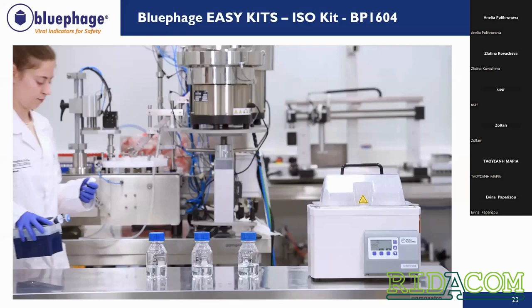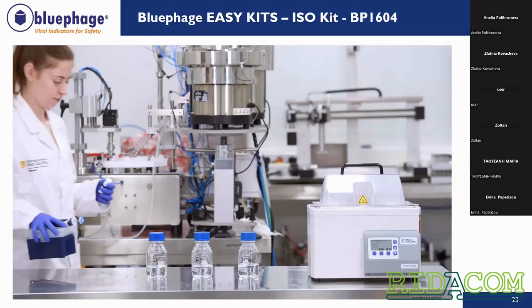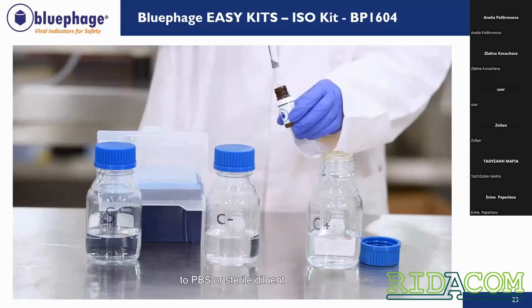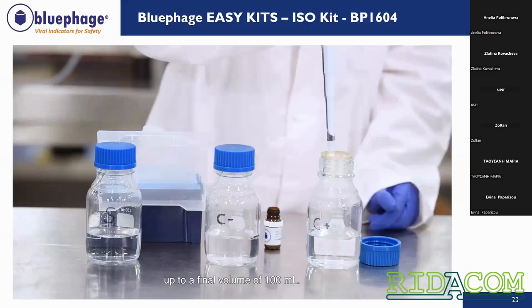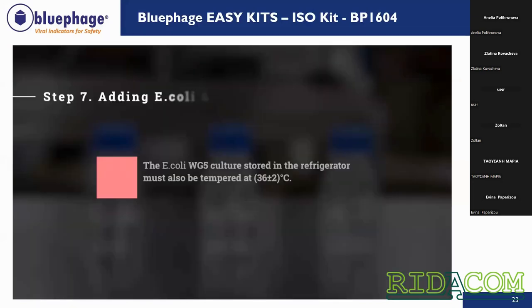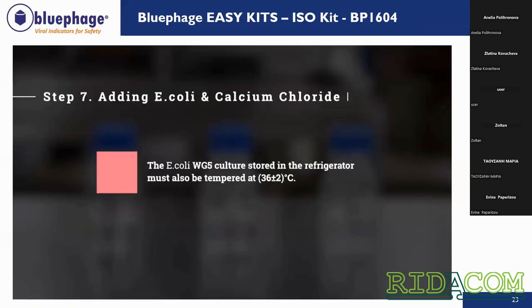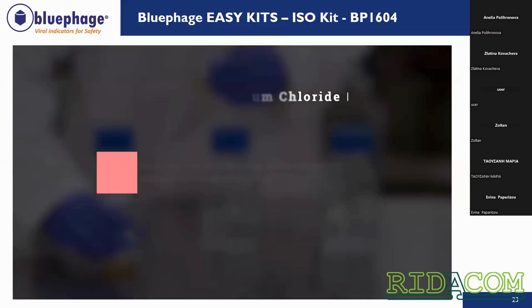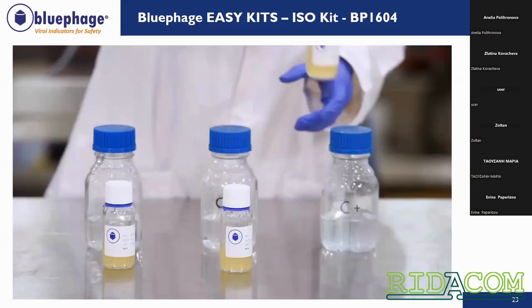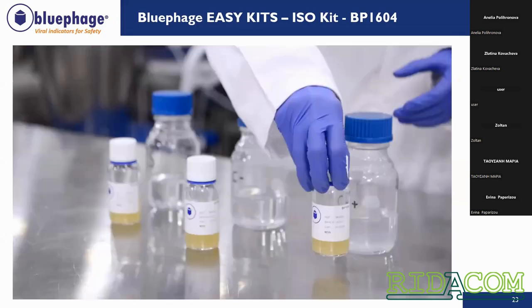And after that, we will put 1 mL of this positive control into the sterile diluent, PBS. So once we have pre-warmed and prepared our positive control, now we can start everything.